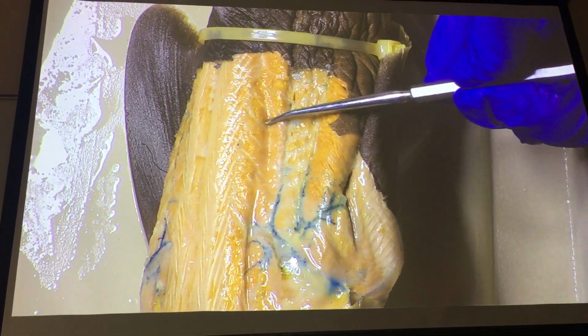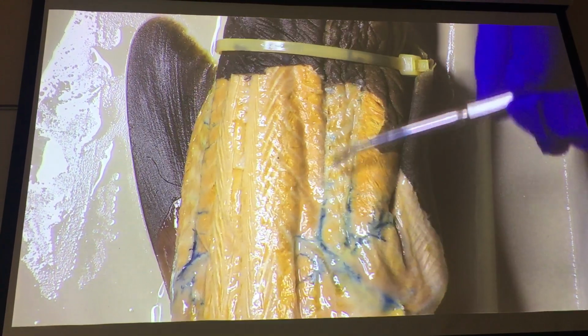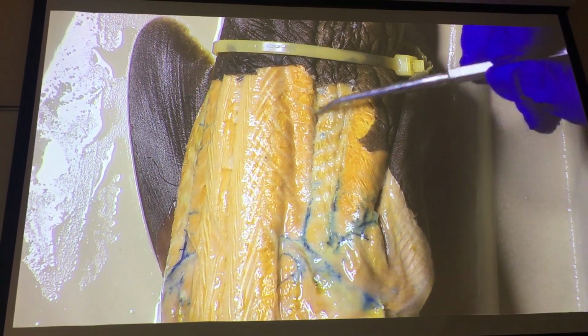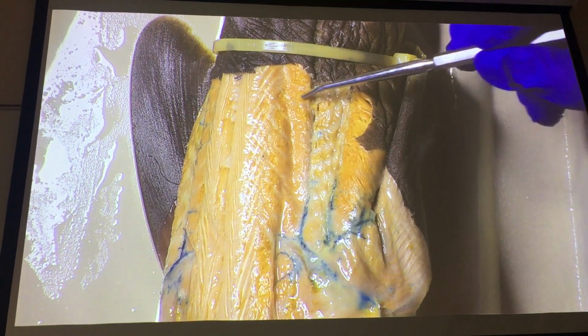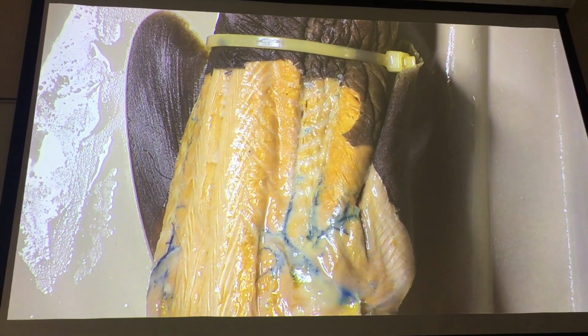What's the name for this muscle segment? What's the name for this connective tissue partition? What's the name for this group of muscles versus this group of muscles? So you know when I'm looking for epaxials or myomeres or what.